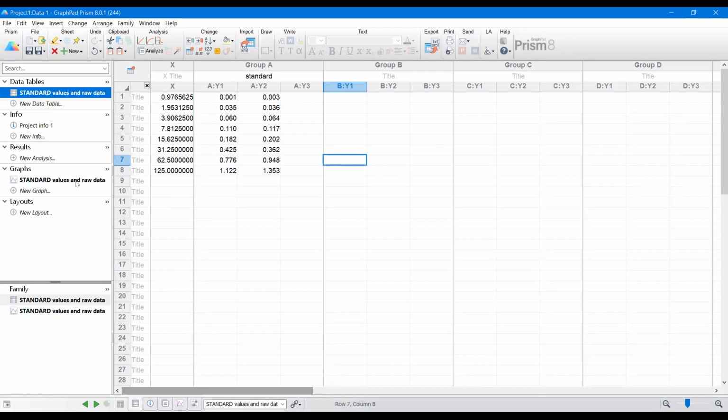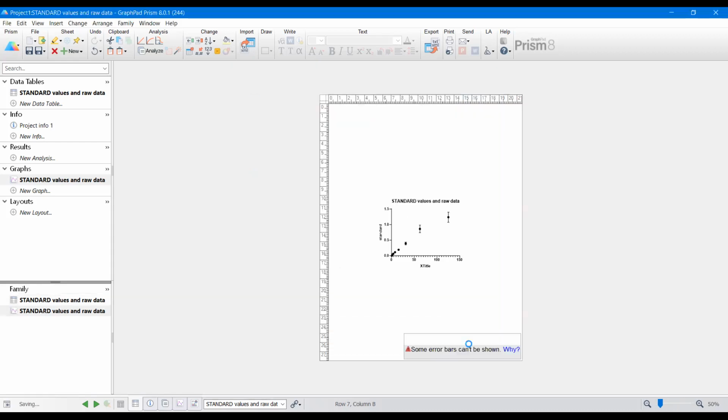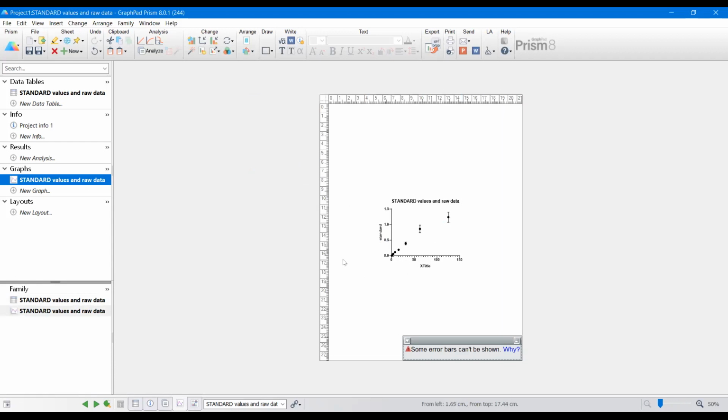Okay, afterwards, if you click on here, now GraphPad is going to ask you what you want to represent and how it looks like. So in my case, as you see, because there was an increasing manner, now it is written there, all the values. And based on that one, you can choose different ones like this way or this way, but that's not really necessary to change everything. It is totally fine if you just click OK. Now you have a value here.